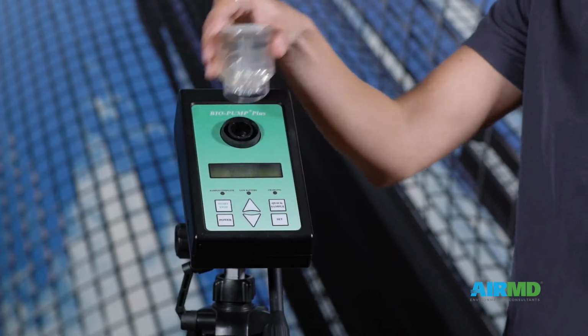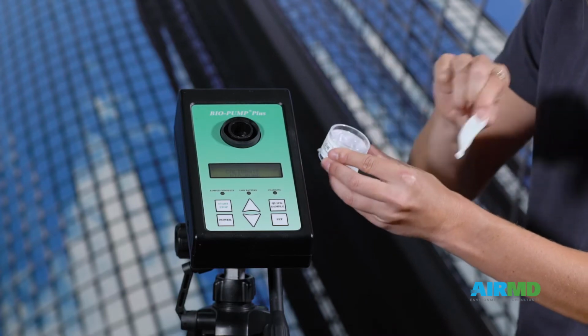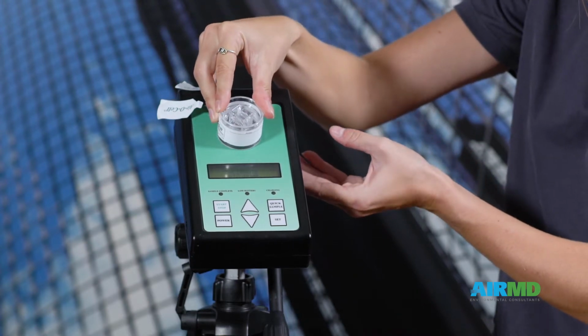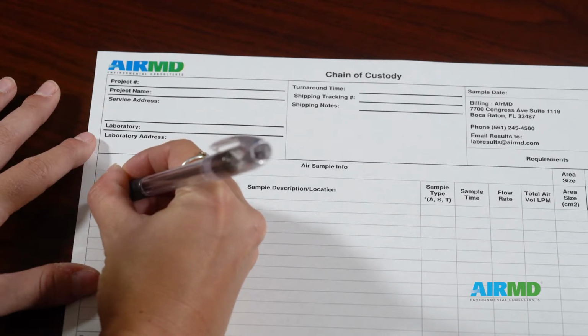Then remove the rotometer. Remove the sticky tabs on the top and bottom ends of the cassette and stick the tabs on the pump for later use. Attach the cassette to the pump and record the cassette number onto the chain of custody.